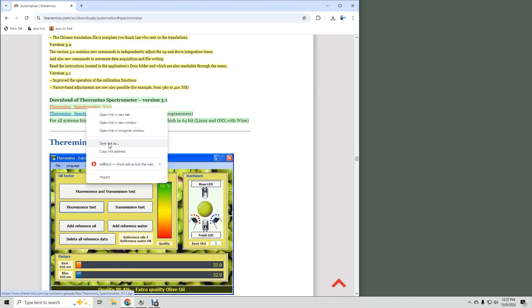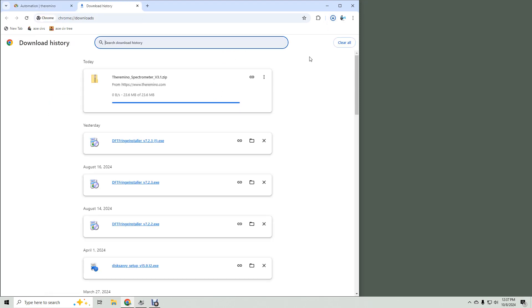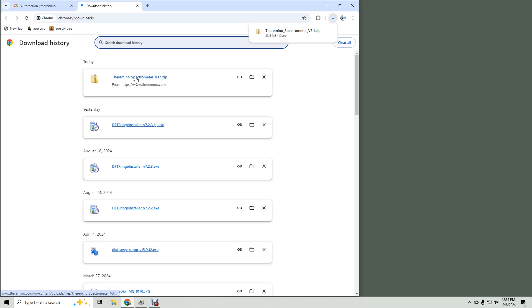You might have to right-click and choose 'download link,' but I just clicked it and it downloaded. I hit Ctrl+J to see downloads — this works for most browsers.